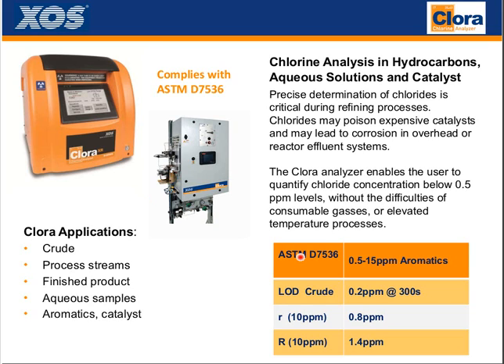The current Clora does have a method behind it, and that's D7536, which is a method specifically for aromatics, like we talked about, for toluene, benzene, xylene samples like that. And the method is written around concentrations from 0.5 ppm up to 15 ppm. So currently that is the only ASTM method we have, but we are working on other things, and further into the presentation, I will touch on those a little bit.